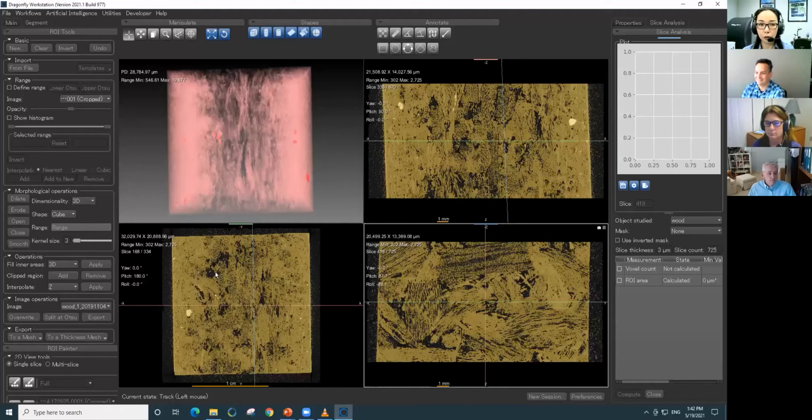In terms of fine tuning the parameters of how the network behaves, or choosing a specific algorithm to use to train, I will refer to Mike. But other than that part, you do have a control over how you train it, how your example looks. So if your example is sloppy, your machine learning segmentation result is going to be sloppy. So you have a control there. And also fine tuning you can do.